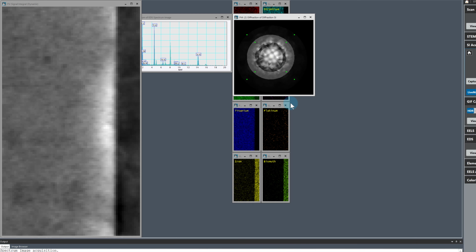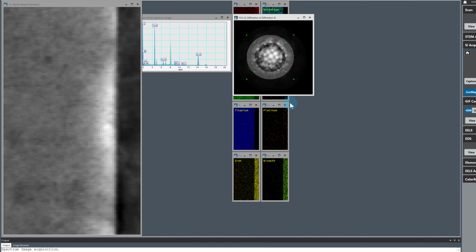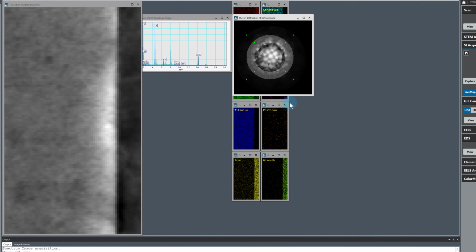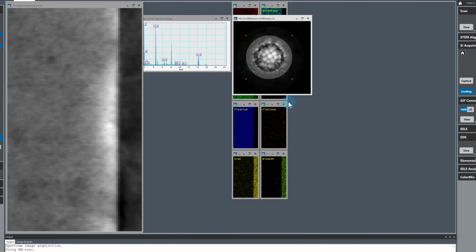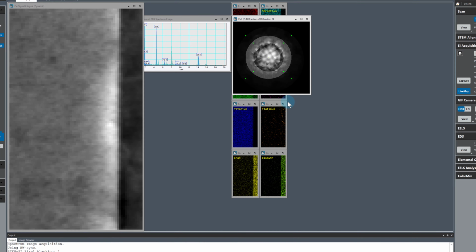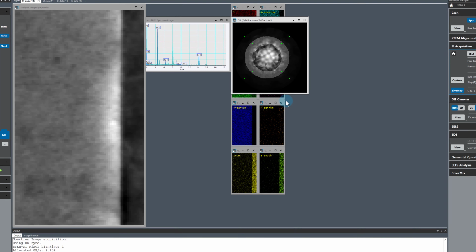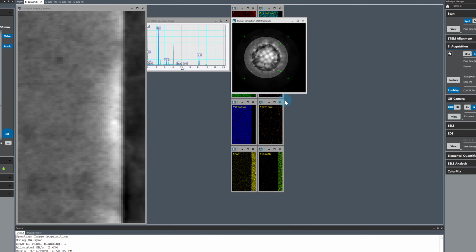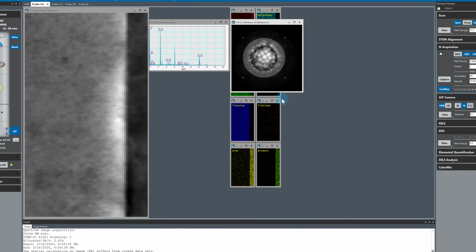That's all I want to cover for now, so I'll wrap things up. Over the course of this 3-part tutorial, I've demonstrated a fast, simple, and easy workflow for elemental mapping and 4D STEM using GMS 3.4 and the GIF Continuum. All of the setup, data capture, and mapping that I've shown can be completed in around 15 minutes, which hopefully you can reproduce and improve on in your own labs around the world.